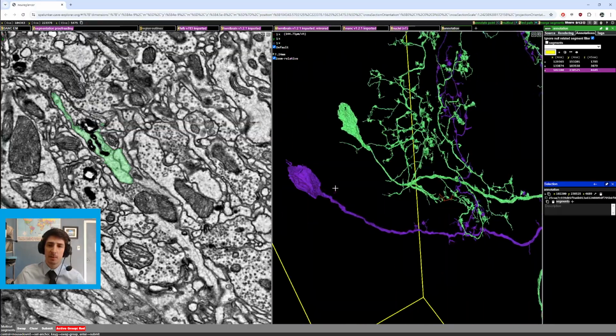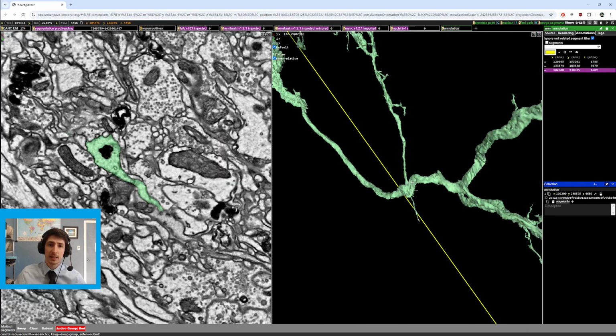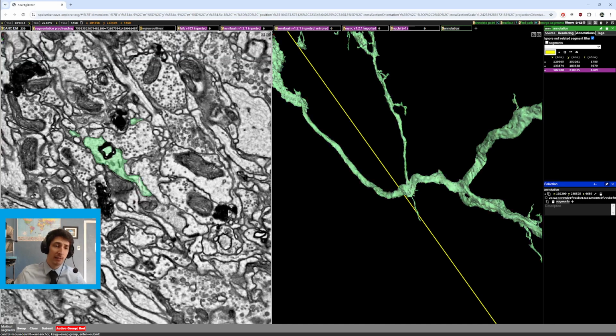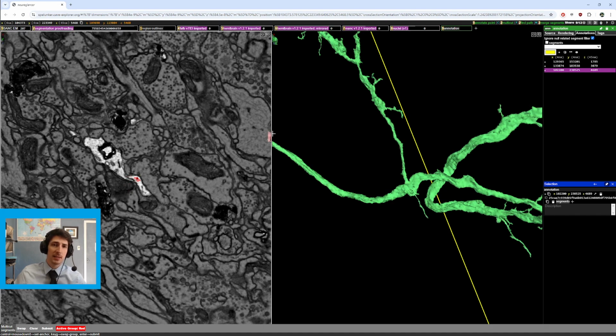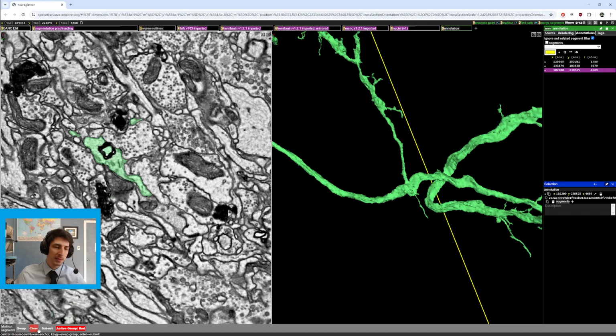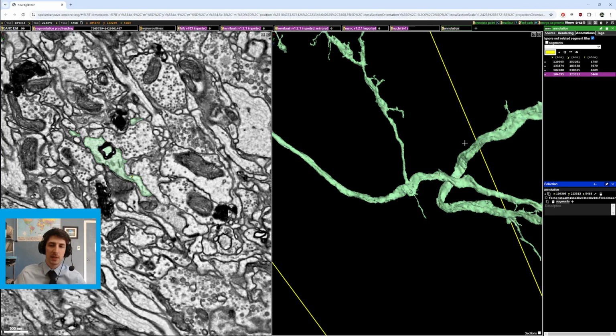Yeah. So one thing that is interesting here, I'm just going to put an annotation point here because, hey man, I didn't find those earlier. Oops. The reason that didn't drop an annotation is because I'm selecting the segmentation tab and the cut menu is open, so we can clear that. We can hit C to turn that off, right click on our annotation tab, and drop an annotation point down.